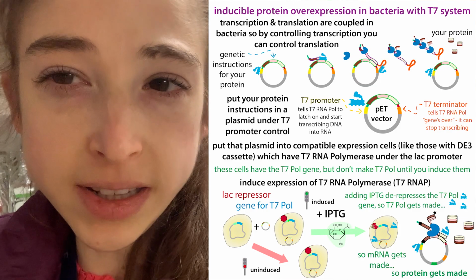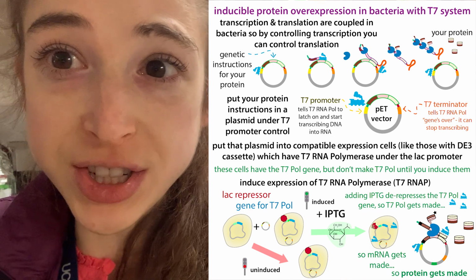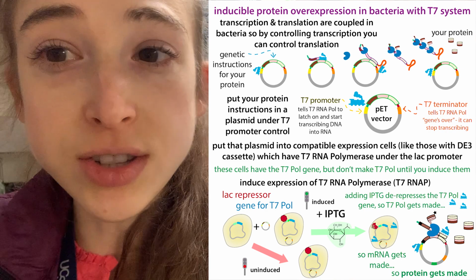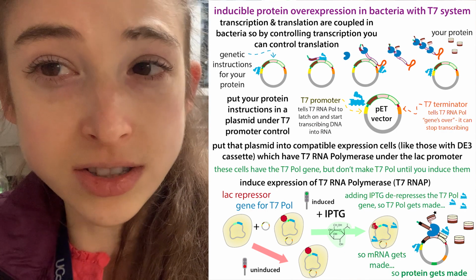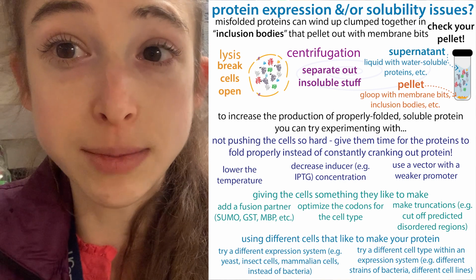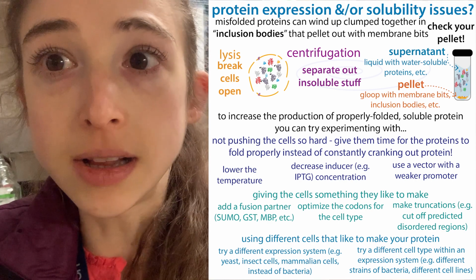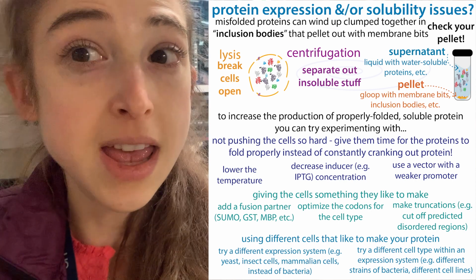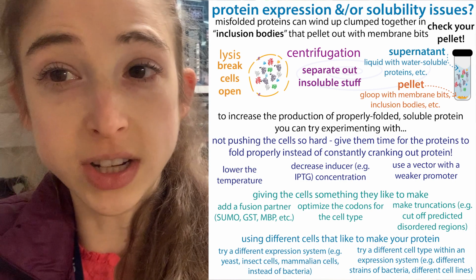One more thing when it comes to solubility, especially with overexpression in bacteria, sometimes you're just asking the cells to do too much too fast. And so with overexpression, you're basically saying, make this, make this, make this. And this isn't giving time for the proteins to get made and folded properly. And so sometimes if you don't overexpress it as much, you can lower the induction, the IPTG concentration. You can also try lowering the temperature that you're expressing at, slowing things down so that the protein has a little more time to fold, as well as lowering the total amount of protein in there that is then going to be available to help clump things up. And so there are other strategies you can take to help solubilize things in bacteria, and you might just need to slow things down and lower the levels of things. So much more on that in my other post on troubleshooting expression I'll link to.